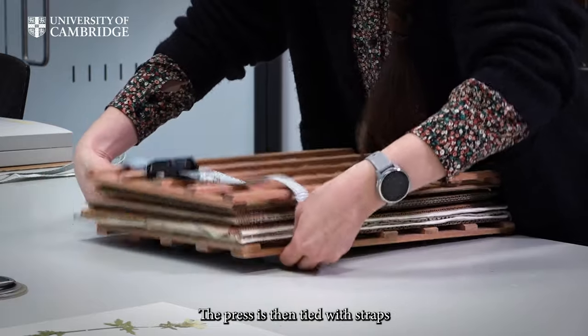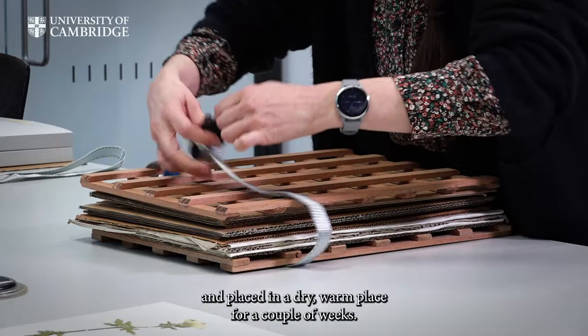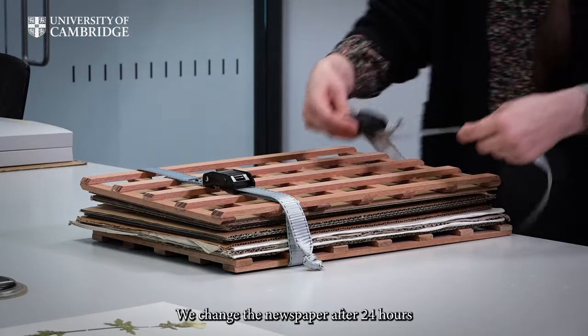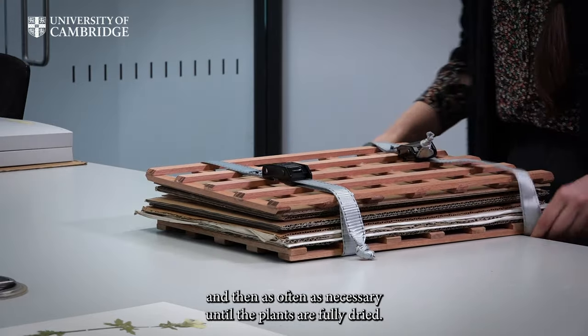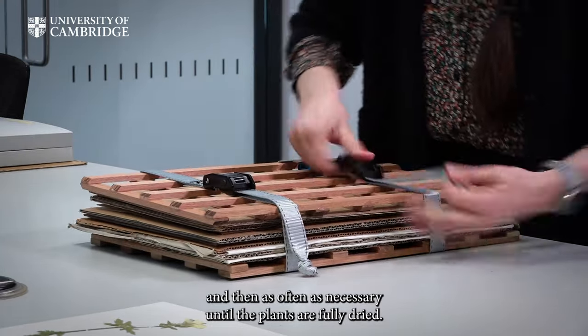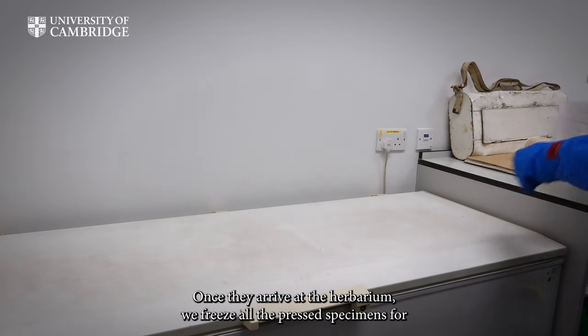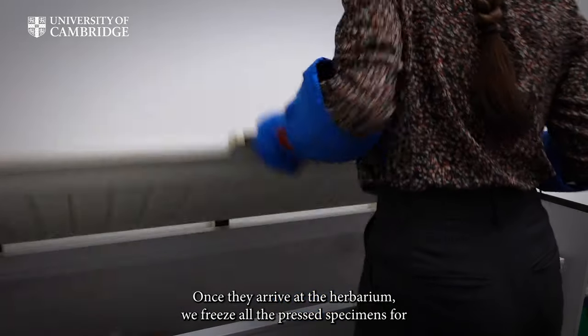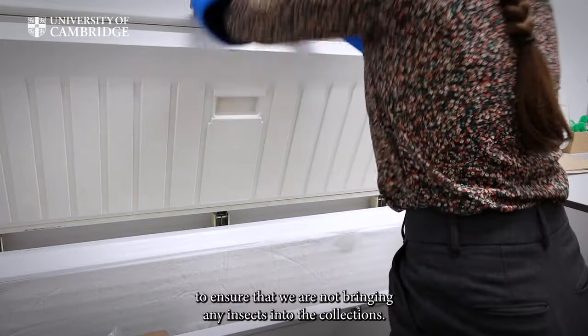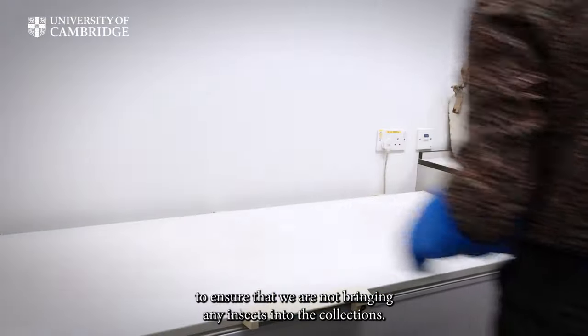The press is then tied with straps and placed in a dry warm place for a couple of weeks. We change the newspaper after 24 hours, and then as often as necessary, until the plants are fully dried. Once they arrive at the herbarium, we freeze all the pressed specimens for at least three days at minus 40 degrees Celsius, to ensure that we are not bringing any insects into the collections.